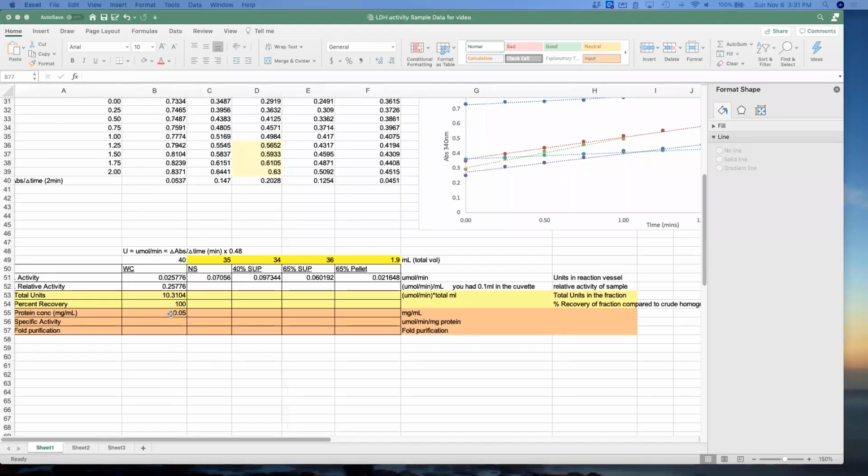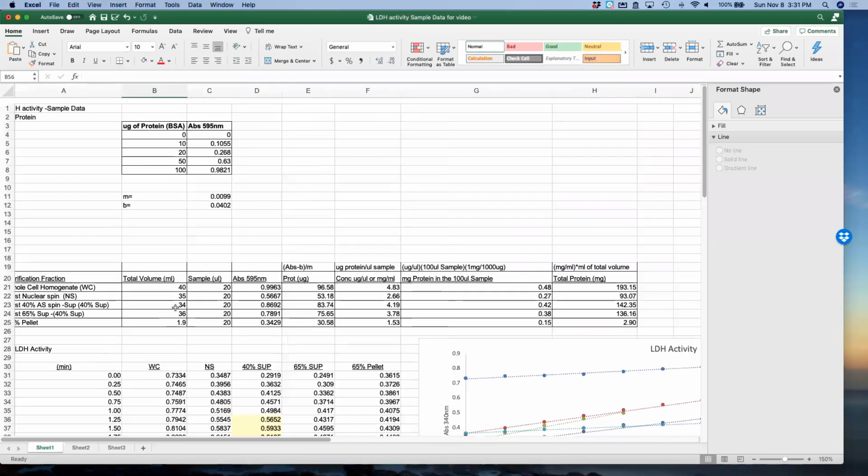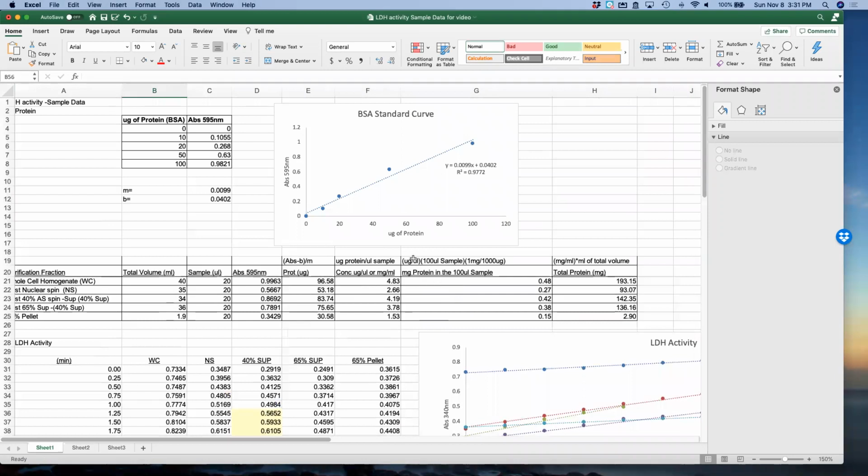And I'm just jumping ahead of myself. All you need in this one, I'm sorry, all you need in this one is we're just going to pull it down. I'm not going to do anything to it yet. That's our protein concentration, right? We just pulled it. Our protein concentration right here. Okay. It should have been this one.